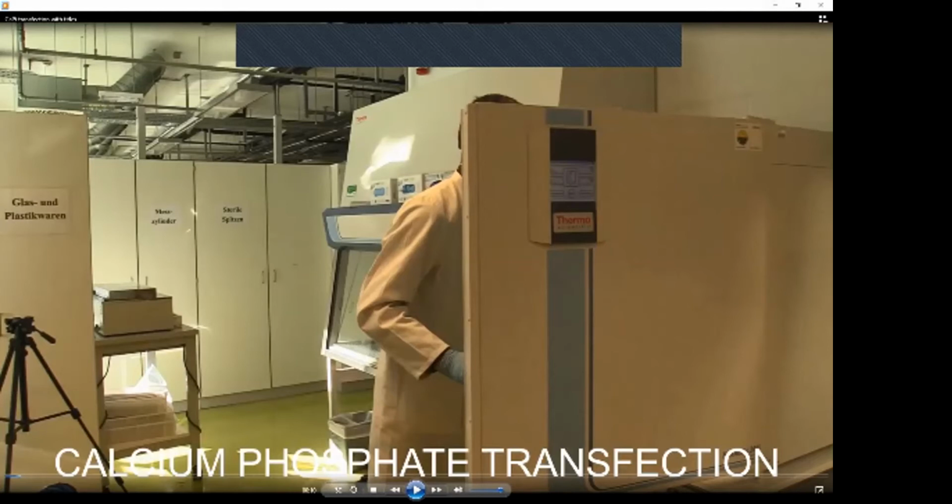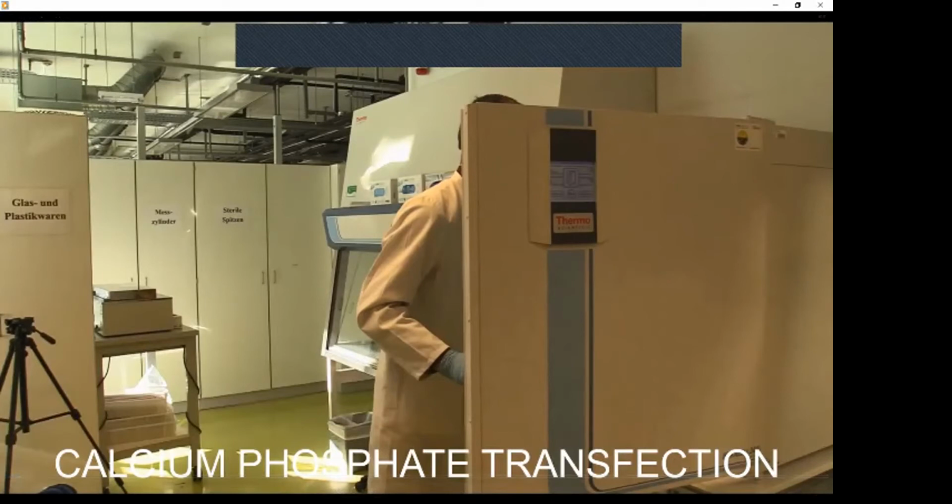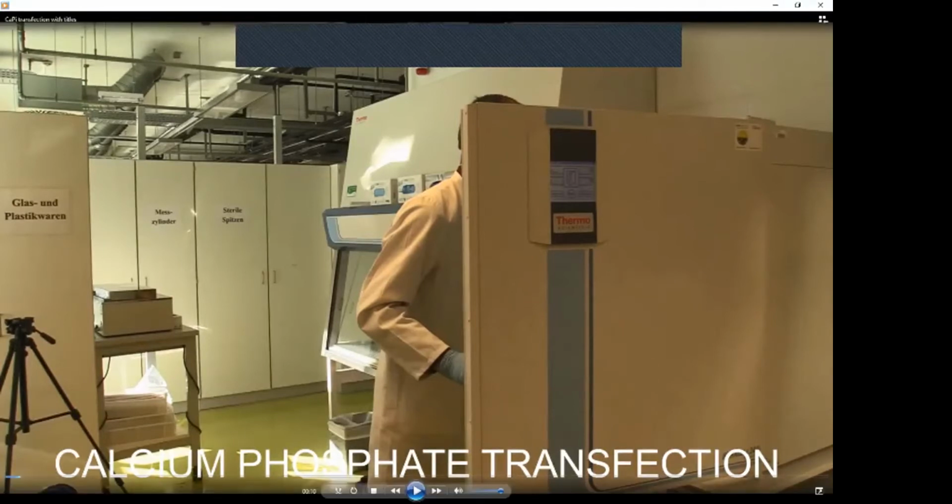The idea is that on the day of transfection, it is optimal to have 60 to 80% confluency of cells, because then the efficiency of transfection is highest. That means that for each cell type, cell line, one has to test the number of cells in pilot experiments.